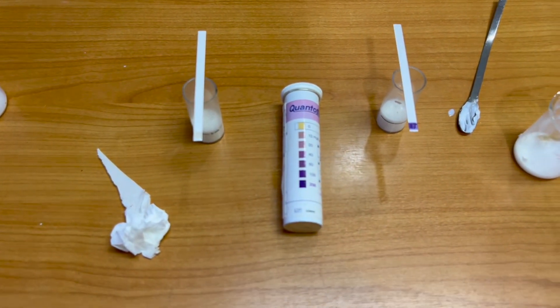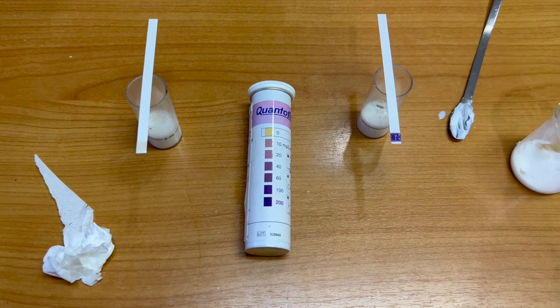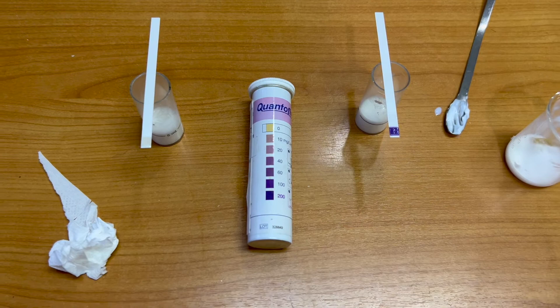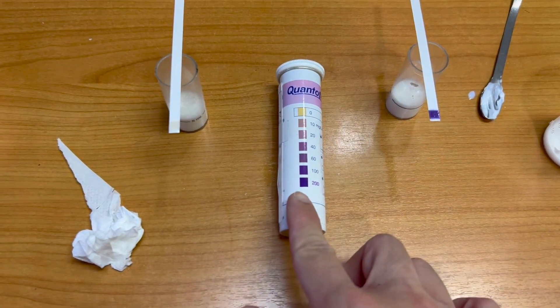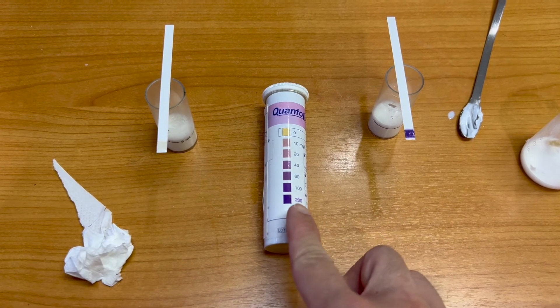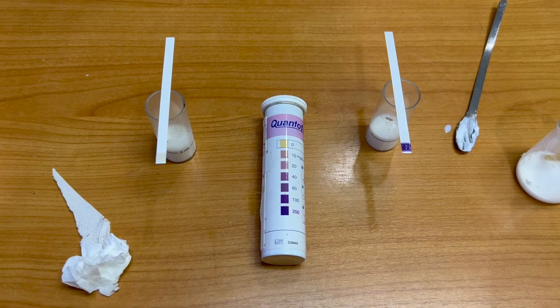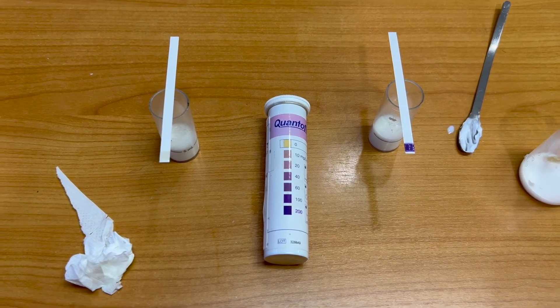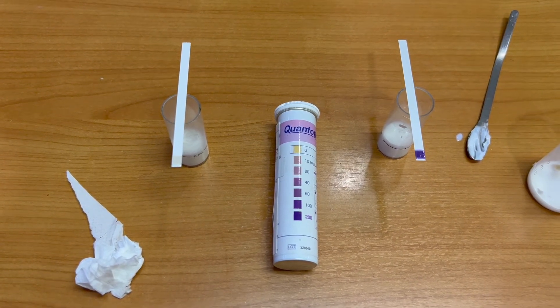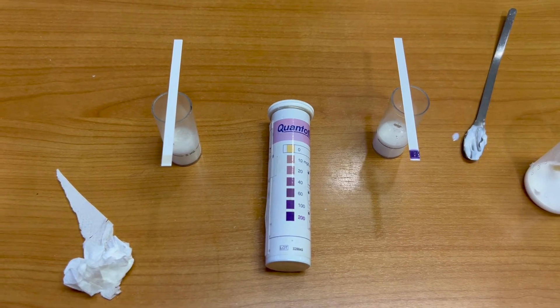You can see the sample on the right — it comes up with a purple color very quickly. The deeper the color, the higher the formaldehyde content. On the right side is your rubber clear sample, and on the left side is our rubber clear sample. You can see the difference in formaldehyde content.